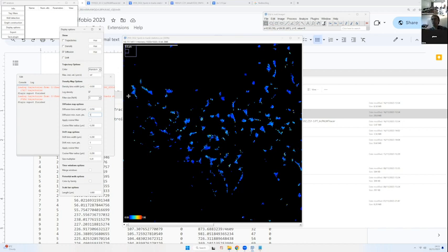When we just use the square grid, we take all the displacements that start in each grid, so the resolution and the computation are linked. When we use the cosine filtering, instead of looking at the displacements that fall into a bin, we look at all the displacements that fall in a circle around the center of that bin. The radius of this circle is controlled by the parameter cosine filter radius.